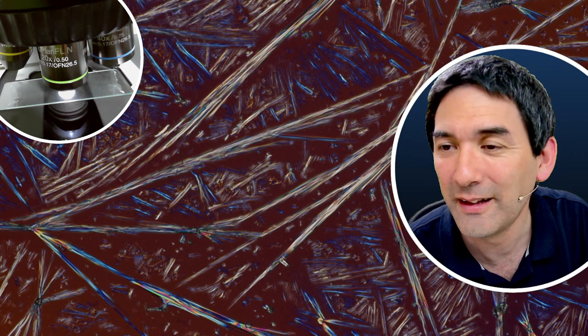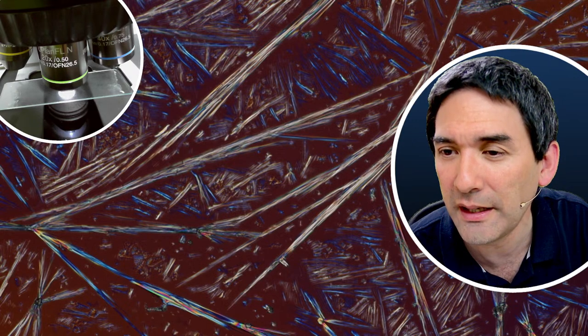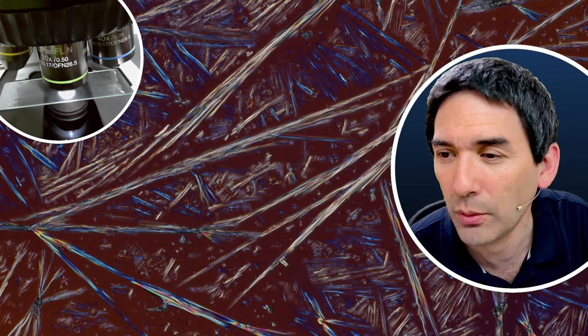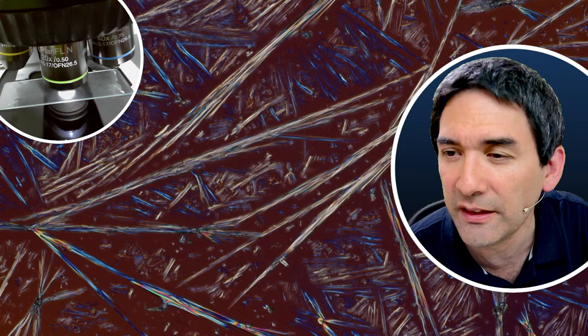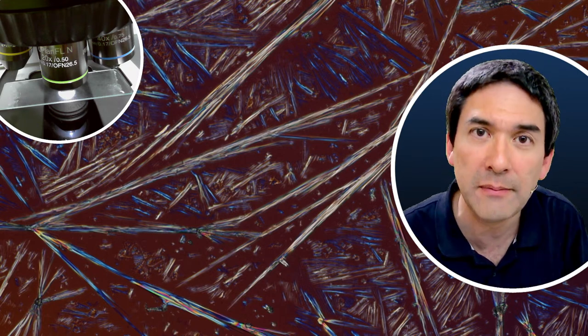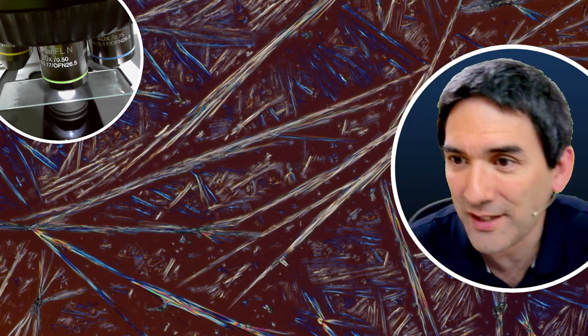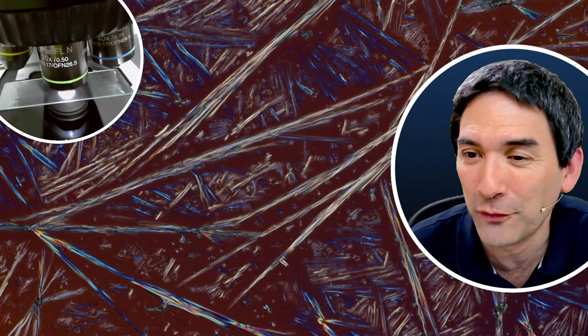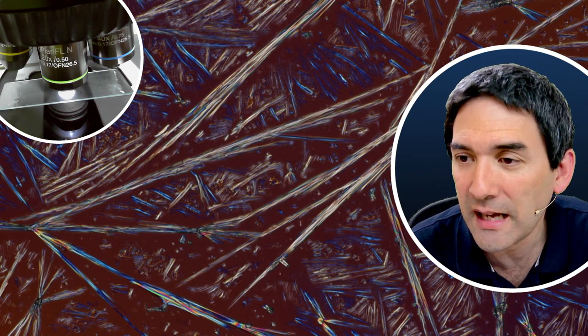Okay. Thanks for the explanation. So I go down again. I'm simply going to skip down to where you have this at Microbehunter. It looks like these polarizer films from these glasses also use a quarter wave plate. Yes, this so-called quarter wave plate makes it circular polarizing. So that's what you just said here, like a circular polarizer for photography. Yeah, they too can't be reversed and look similar. Yes, that's exactly the thing.